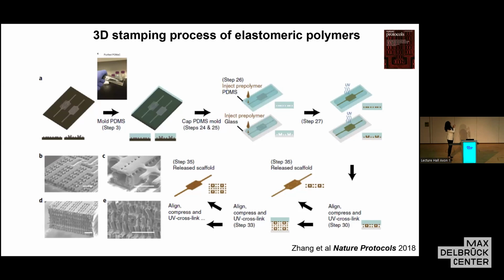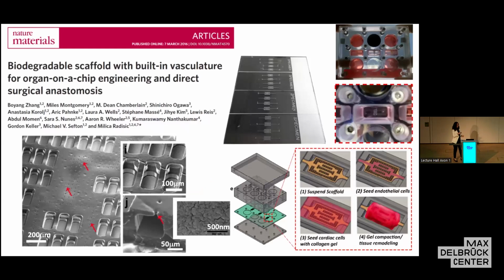And around the channels, there is a lattice, and you can seed cells into that lattice. So please also note that there are microchannels here. This process is manual, but it's also scalable. You can get enough angiochips in a relatively reasonable amount of time in the clean room.